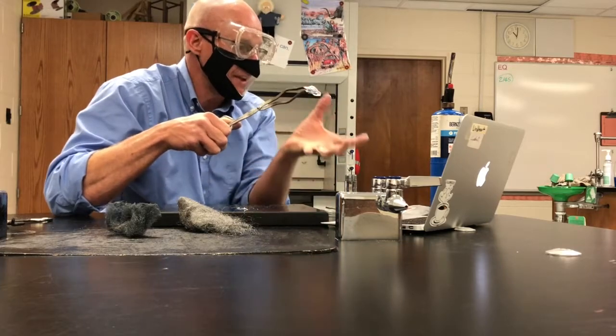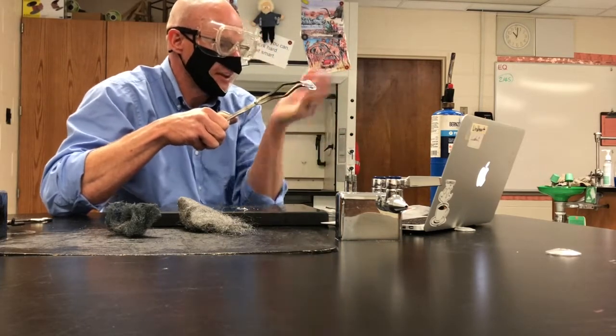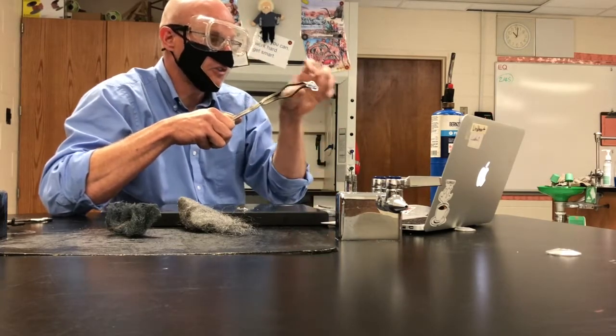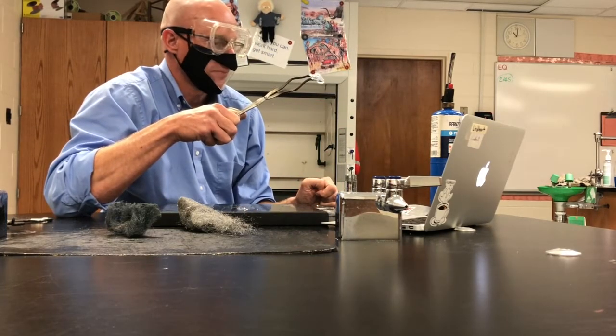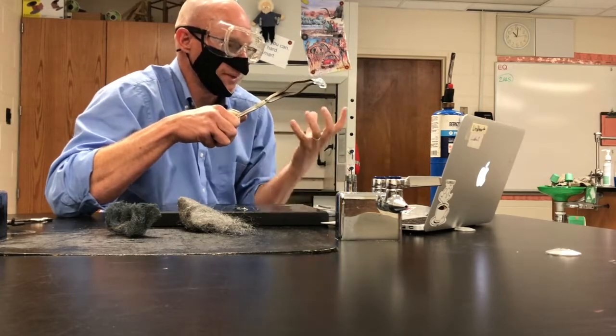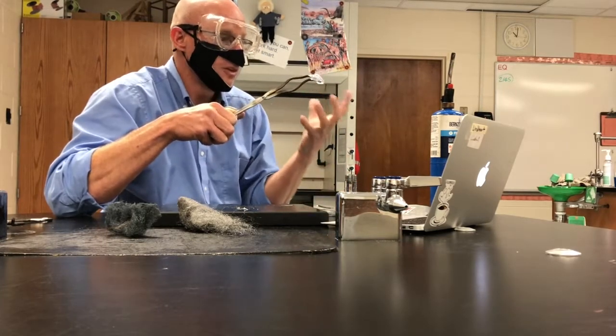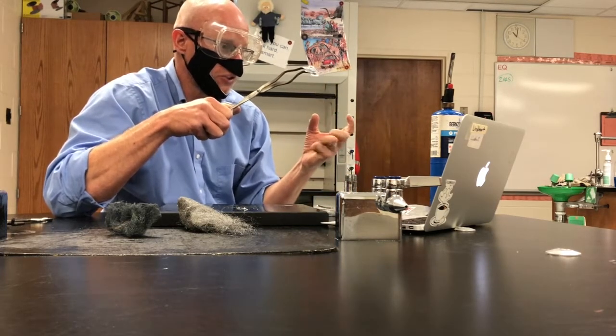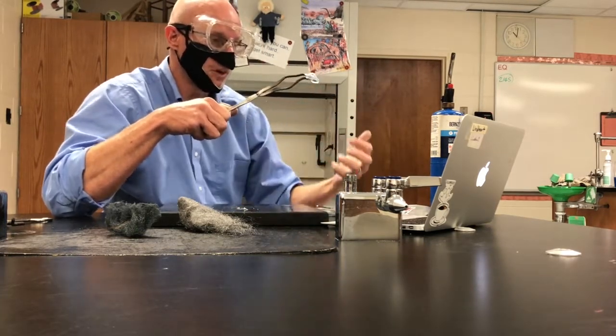If I had to get the mass, it would actually be heavier, because we don't just have magnesium anymore, we've got oxygen particles stuck to this. And when those particles stick to it, they make it heavier. And so we've made new particles. Okay? Chemical changes cause a change to the particles.